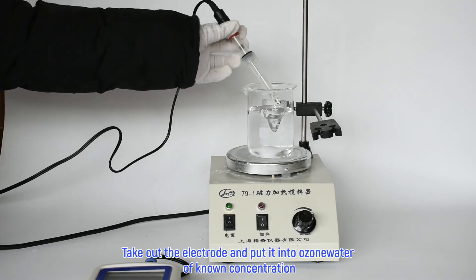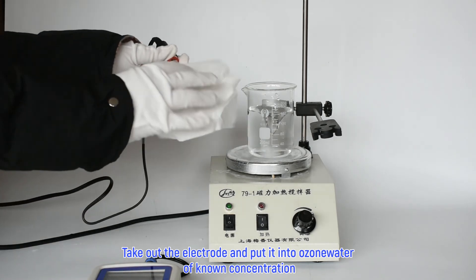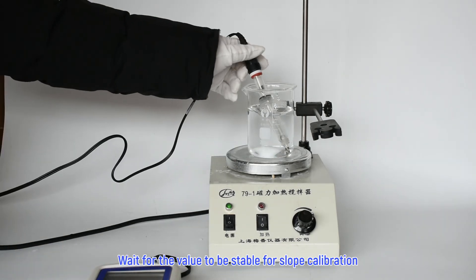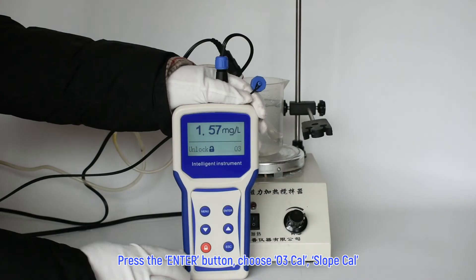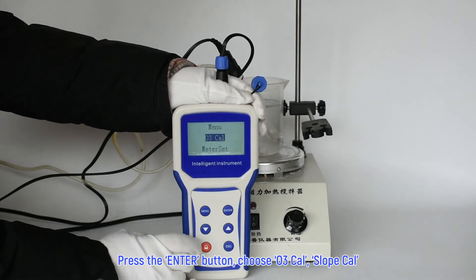Take out the electrode and put it into ozone water of known concentration. Wait for the value to be stable for slope calibration. Press the enter button, choose ozone cal, then slope cal.